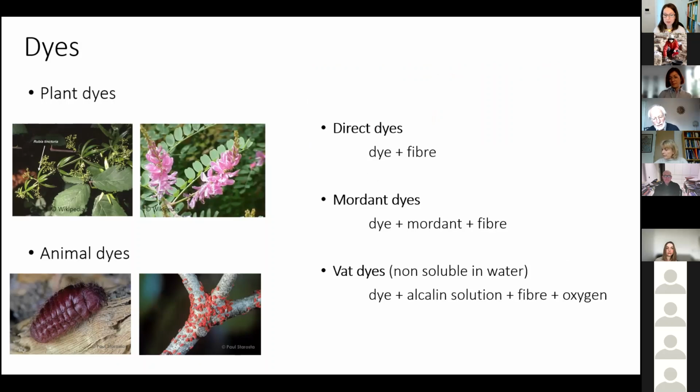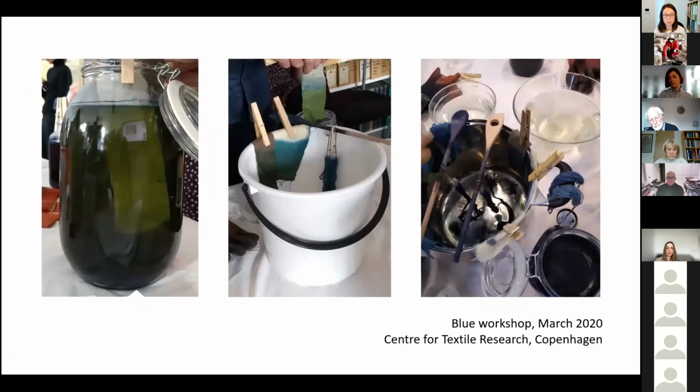So vat dyes are dyes that are not soluble in water, such as indigotin and so all indigo plants. And as John Peter stated, it is usually difficult. This is something you must be aware of: when we have the result of your analysis, it will give you the composition, and you will have several candidates to choose between. So it's not like you have one specific precise answer to your question.